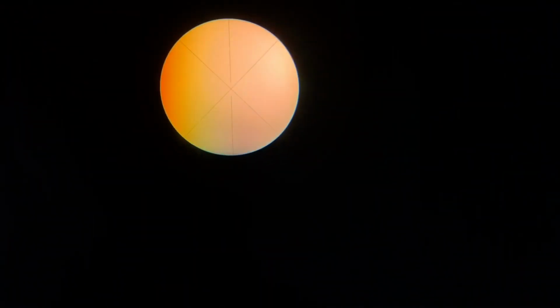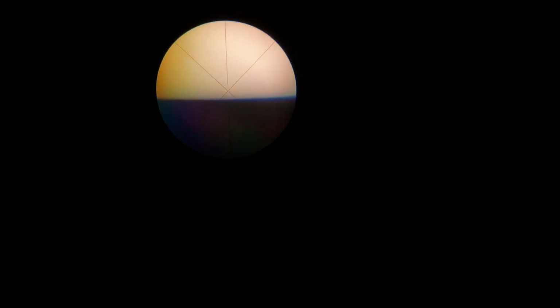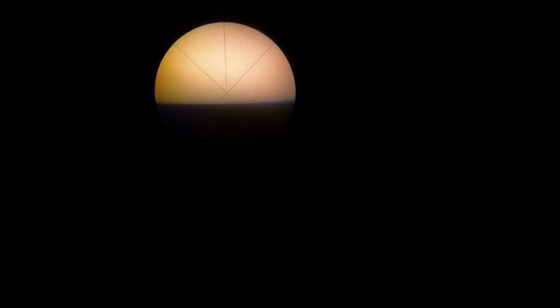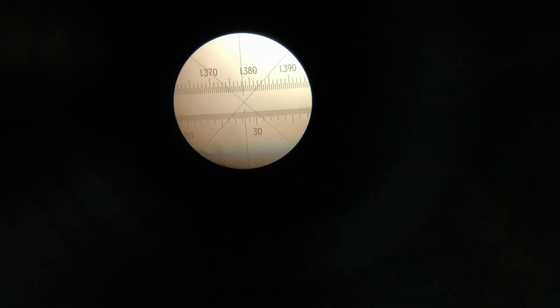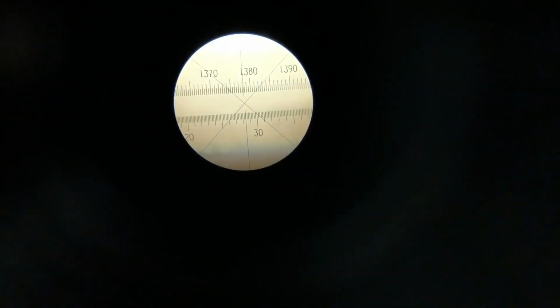There we go. All right, so the crosshairs, I'm turning a dial, which I'll show you later. So that's what I want to see. And I want the horizon here to cut directly through there and meet exactly where that X is. So now that's exactly where the refractive index is. And there's another button, not a button, but a little pin where we push it downward, and then we get the exact number of the refractive index.